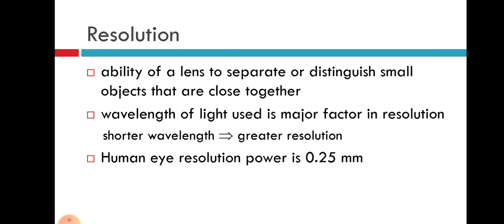The next important factor in microscopy is resolution power, or resolution. The resolution power of a bright field or compound microscope is defined as its ability to distinguish between two particles situated very close. In a magnified image, the object should not only be larger but the detail should also be clear. This is possible when a microscope has the ability to see two points situated very close as two distinct entities. In other words, resolution power is the minimum distance at which two structural entities of an object can be seen as discrete individual structures, even in the magnified image.